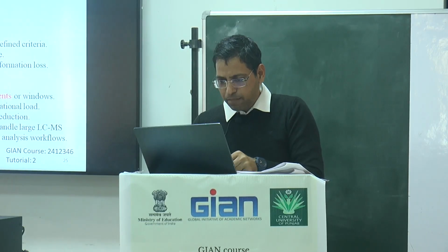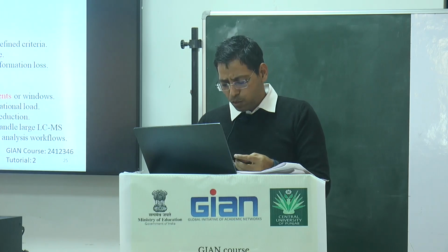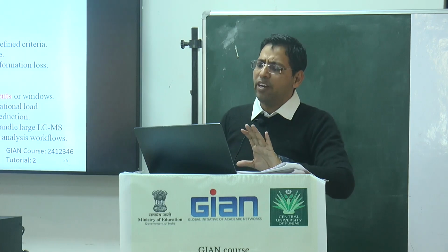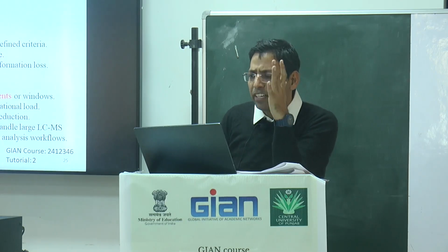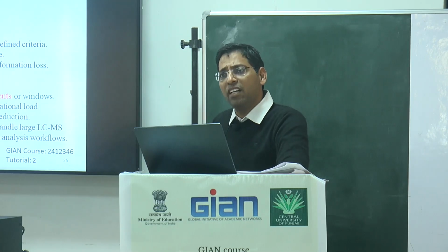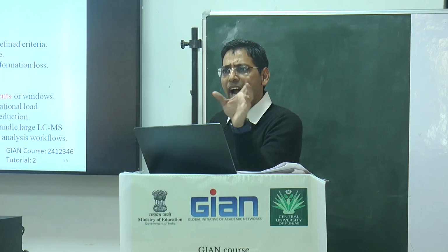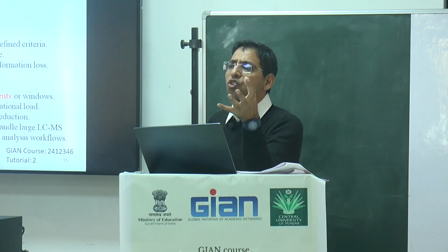So now the second part is the search of the region of interest. Sometimes you are not interested in the whole spectra, you are looking for some specific region only. So better to focus only on those regions. Identify the specific mass region in which you are looking for some specific metabolites and focus on the relevant data segments only. Then it can automatically reduce the volume. If you would like to focus only on a particular region, remove all other things, and just focus on that. That type of data compression is labeled as the search of the region of interest actually.